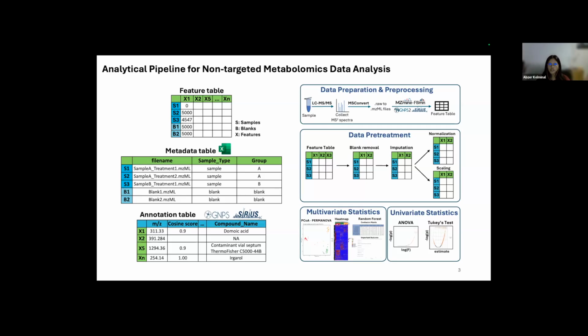Instead of showcasing all the hundreds of features, we are trying to reduce their dimensions into a 2D plot so that we can have a bird's eye view, trying to understand the underlying pattern in the samples. For example, here we see these 3 groups nicely in a PCoA plot. And we also provide clustering, heat map, etc.